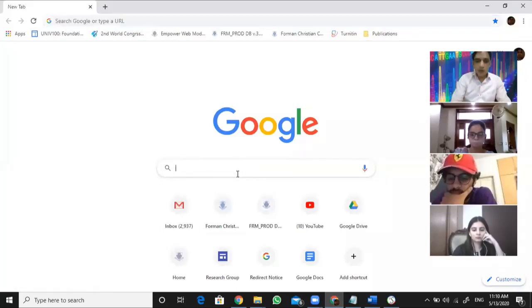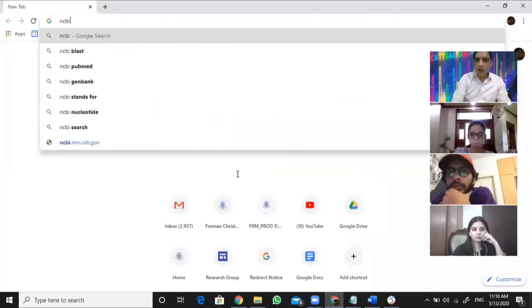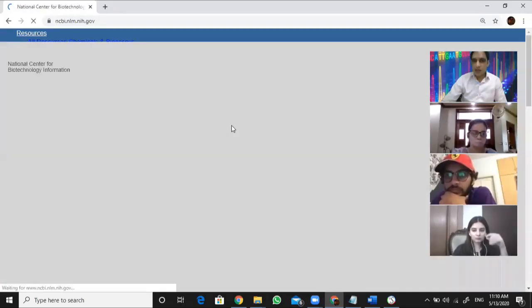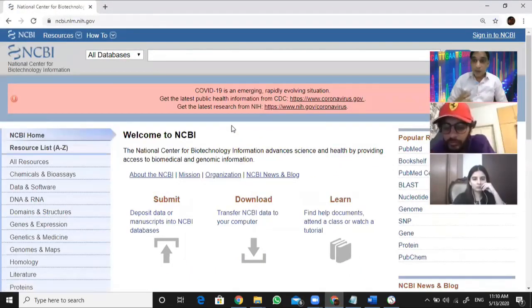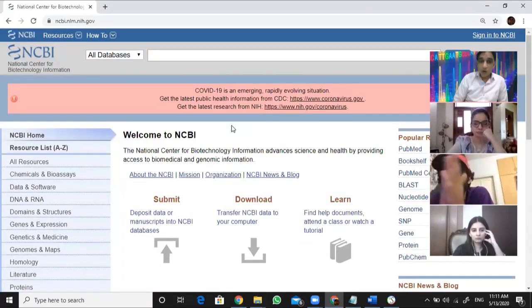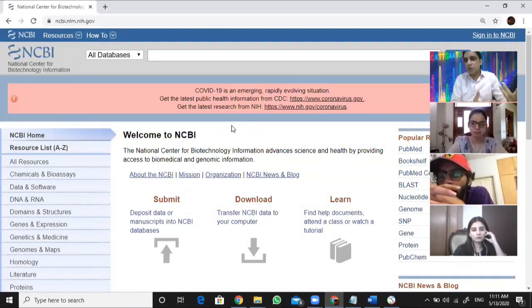The first place I told you is the NCBI, and I'm not putting any extra keywords so that everybody goes to the most basic platform of NCBI. The NCBI itself is a database, a website which is storing information from all fields of life sciences, all published data, as well as all life sciences information which is being generated even today. They are holding, securing and organizing all that data, so we can get that information more easily.